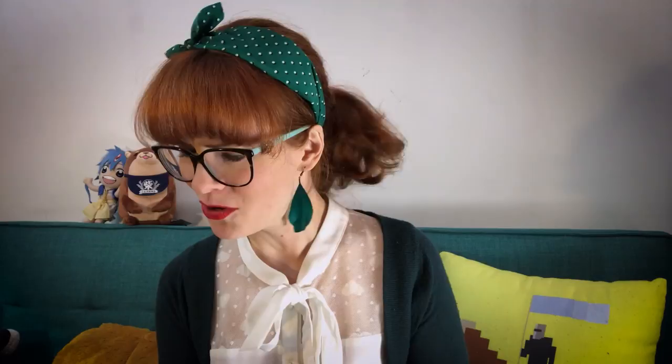It's now a week later and these are the results of our experiments. On one petri dish, we've got some weird little white dots forming, so that looks pretty promising there. And on the other one, not quite sure what's going on — we got some black mold, some orange mold, and some yellow mold.